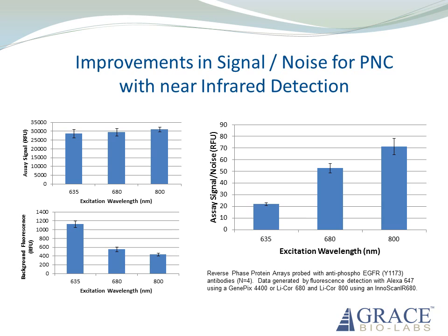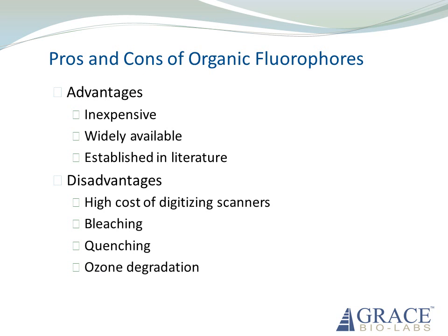Evaluating the background, we saw that it decreases significantly as the wavelength increases. This led to an improvement of almost 4x in the signal to background as the wavelength varied from visible to near IR. Why would anyone not use PNC as an assay surface in the near IR and get 150 times increase in brightness and essentially the same background as glass?